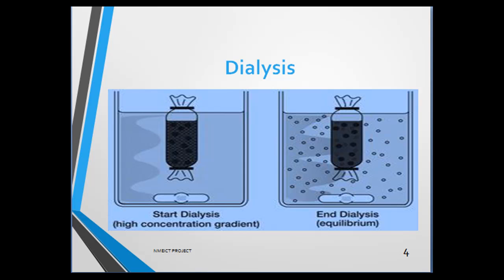If the original sample contained 100 millimole DTT, this would potentially be decreased in the sample to approximately 12.5 nM following the 3 complete cycles. If a further decrease in concentration is desired, the dialysis process can be continued with additional volumes of dialysates.